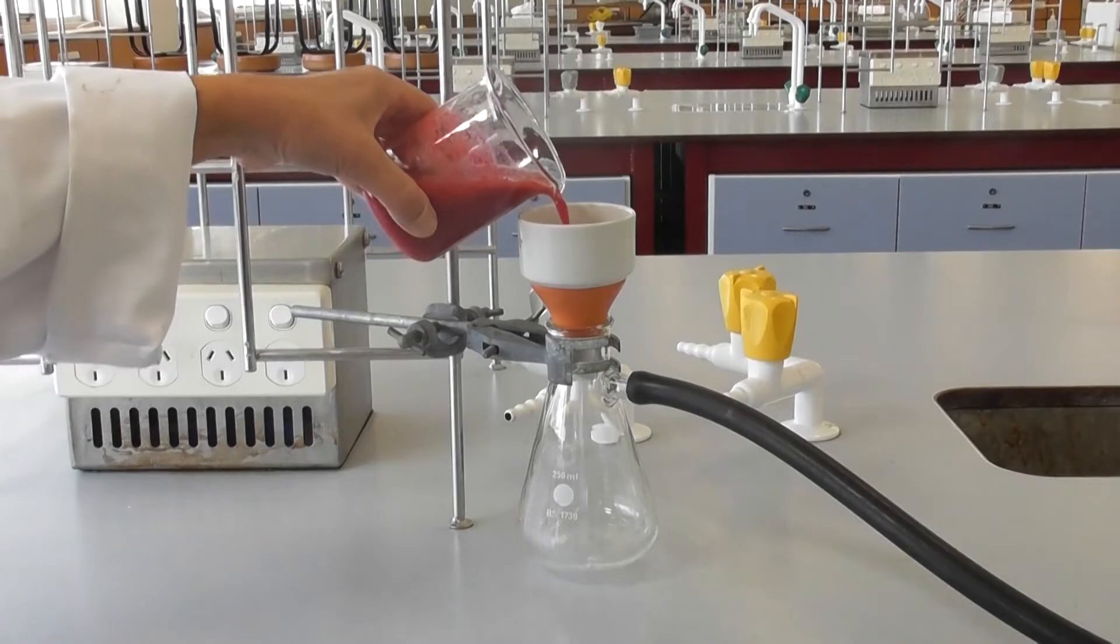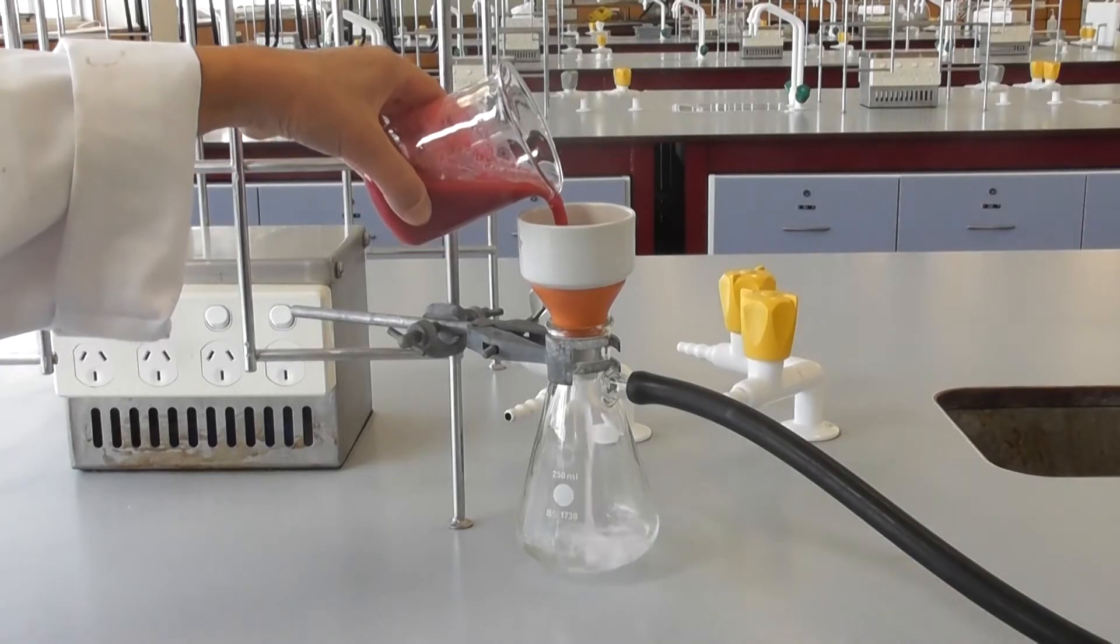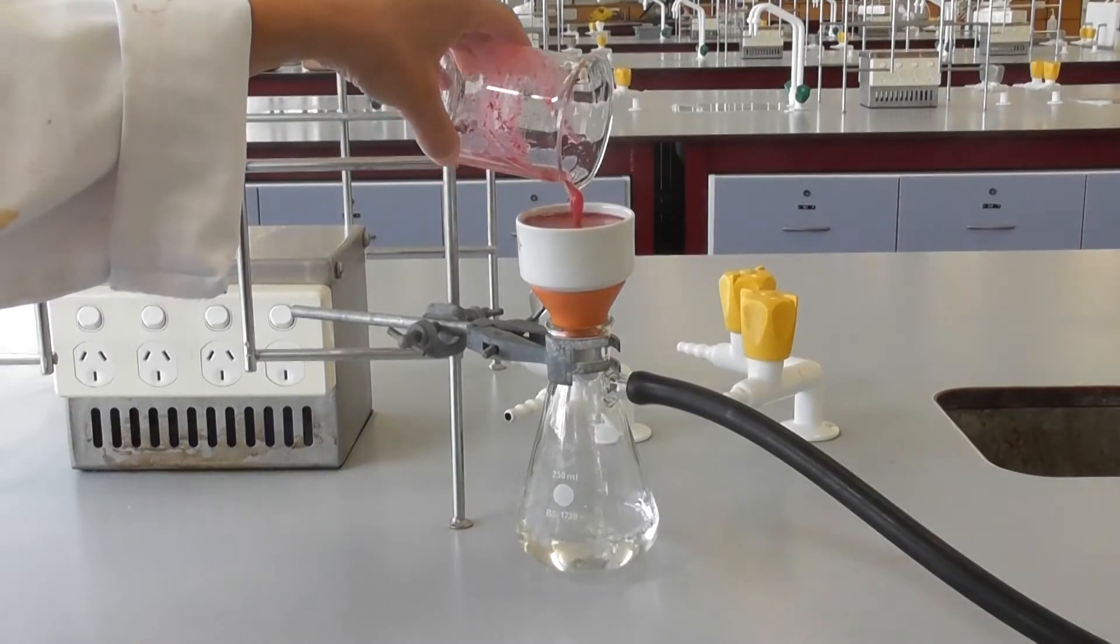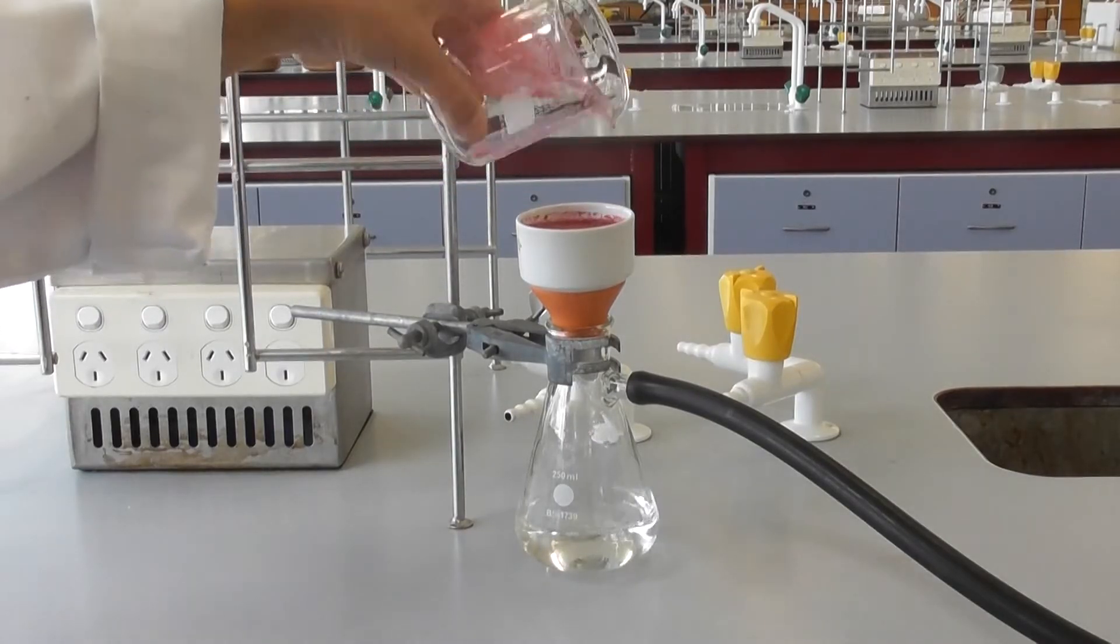Vacuum filtration is a special type of filtration where a liquid is drawn through a filter by applying vacuum. This is generally used to collect a solid product.